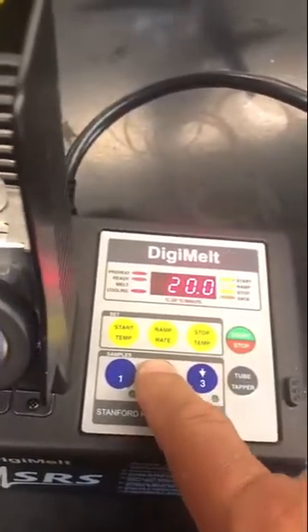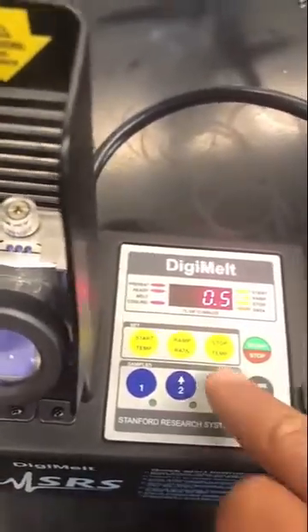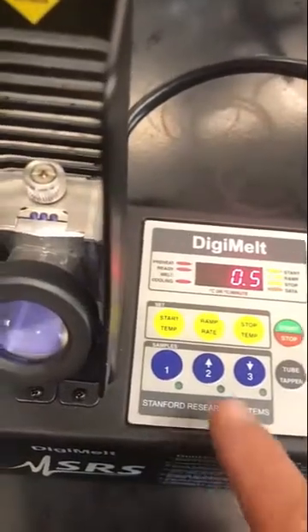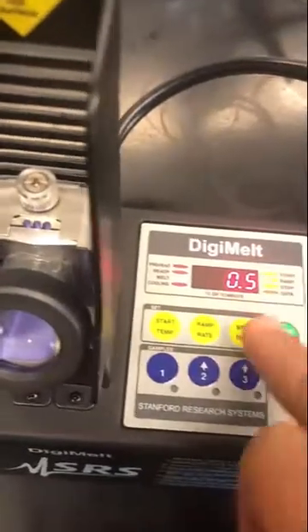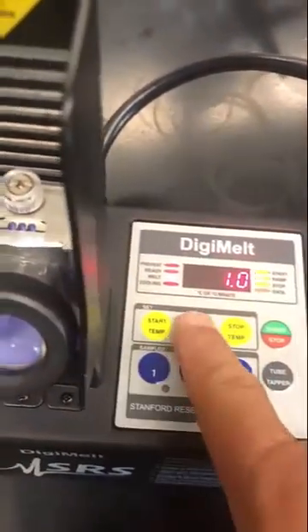I wouldn't recommend 10 or 20 degrees per minute unless you're really scanning and you don't know where the melting point is. But if you really know where it is, then you can go at a half degree per minute, and then some of the melting information you get will be a little bit more accurate. I'm going to set it up to one degree a minute.